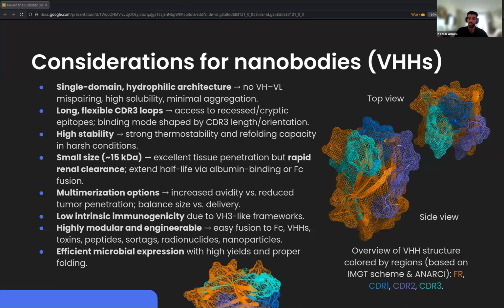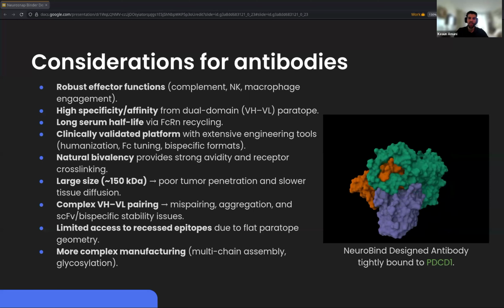Moreover, nanobodies can and frequently do bind and form interfaces via side-on docking, which will make some framework-mediated contacts. Now, this is generally something that's been widely observed, and funny enough, even the Baker Lab has actually noted this within their RFantibody repository. And when you do see this, it's not a bad thing at all. It's generally quite common.